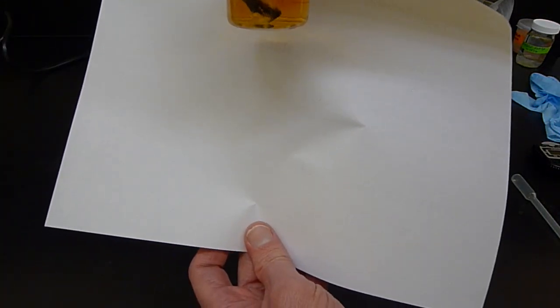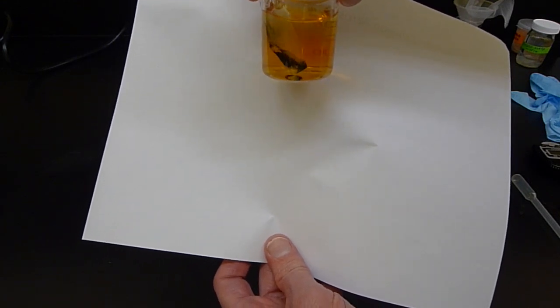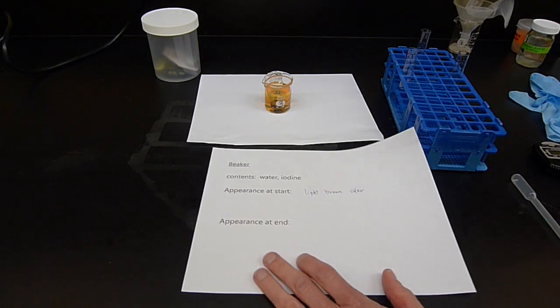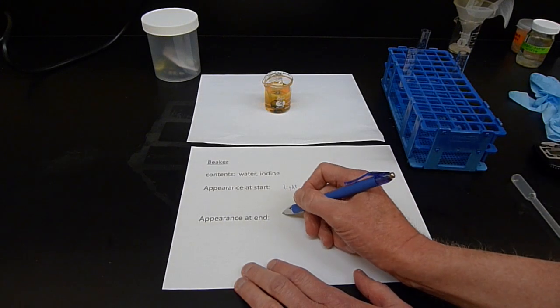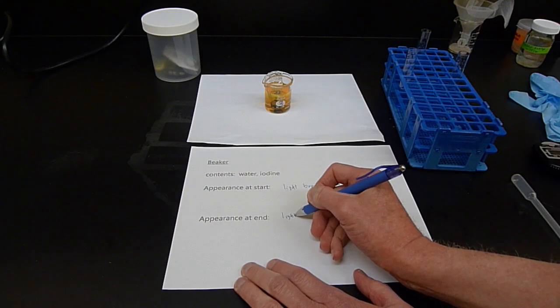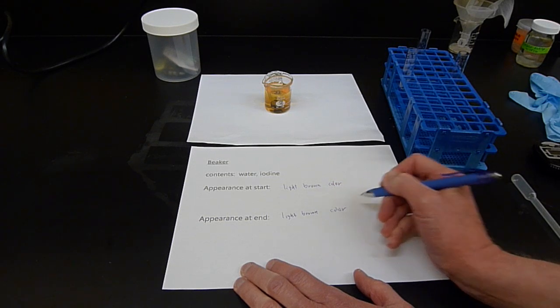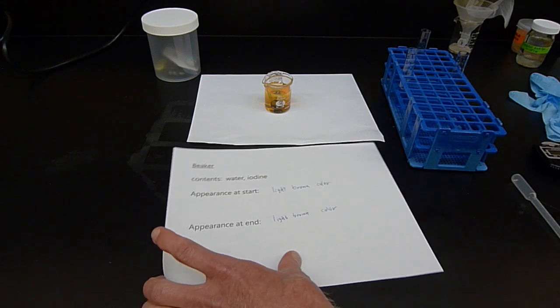I can still see some of the white in there too, but there's quite a bit of black all around the edges there. Now for the beaker, it doesn't really look like it's changed in appearance very much, so I'm just going to record a light brown color here for the beaker, before and after, start and finish.